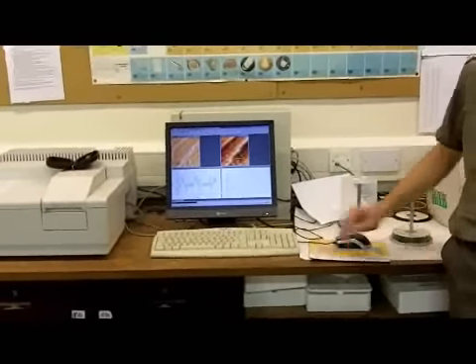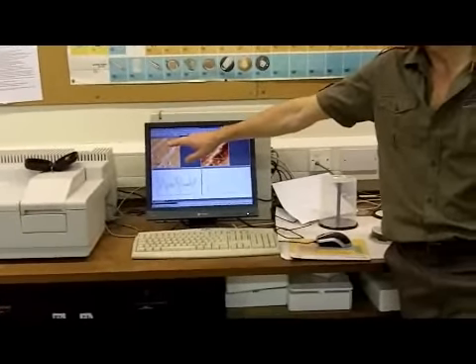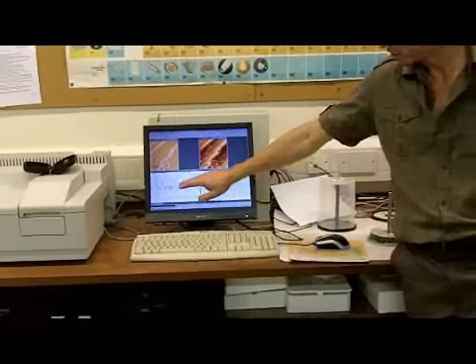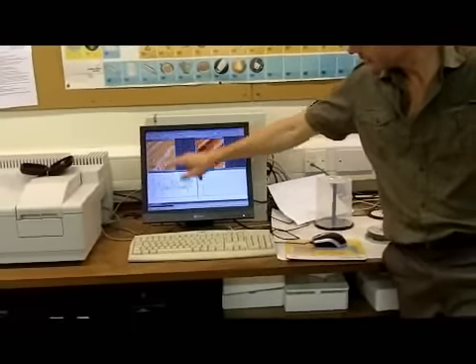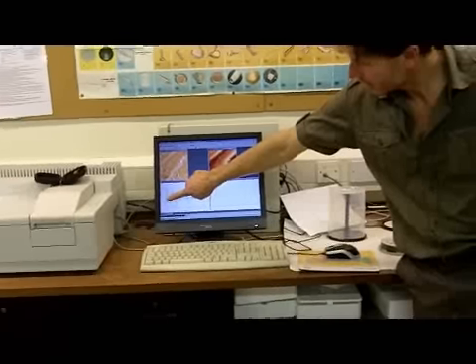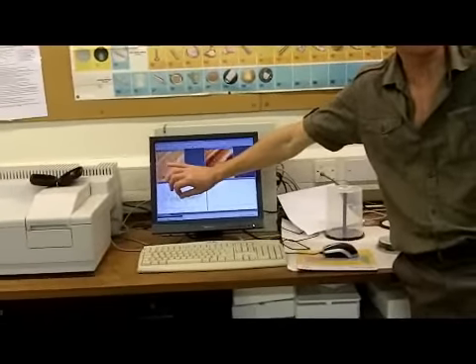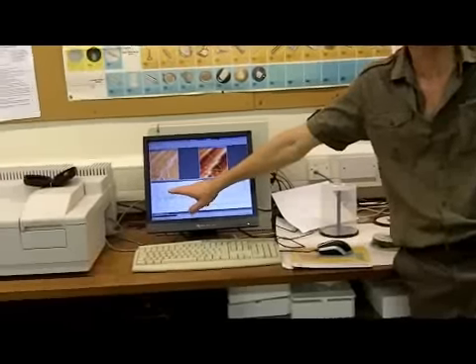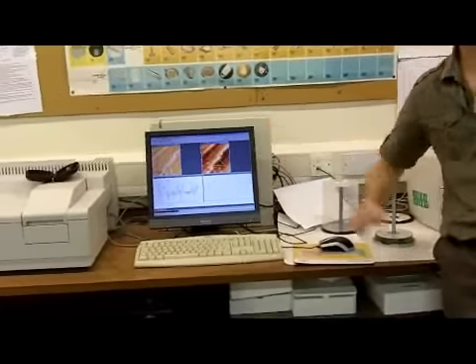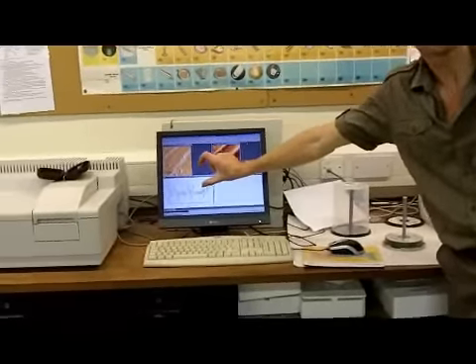Right, a few things to see. First of all, this is the constant height image, and so you get no height information. You can see here, although we've gone across terraces, we're getting no height information, and if you look on the axis on the left, it's telling you it's nanoamps, not height. So don't report to me height information from this sort of graph. This one is showing angstroms on the axis. That's fine, we can measure height. We can measure distance on this one, but we can't measure height.